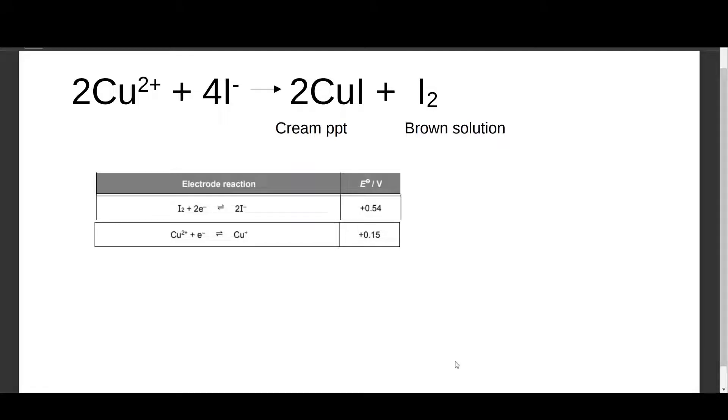In this video we'll take a look at this reaction between copper ions and iodide. During your practical, if you are to see a cream precipitate in brown solution being formed, or you are going to add copper ions to potassium iodide, this is something that you might be expecting. In fact, whenever you add it you'll get a cream precipitate in brown solution.